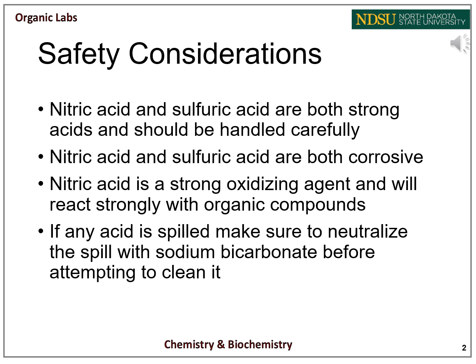Before we begin, there are some brief safety considerations. Nitric acid and sulfuric acid are both strong acids and should be handled carefully. Both are corrosive and will burn you if left on your skin. Make sure to wash any affected areas with copious amounts of water if any does get on your skin.